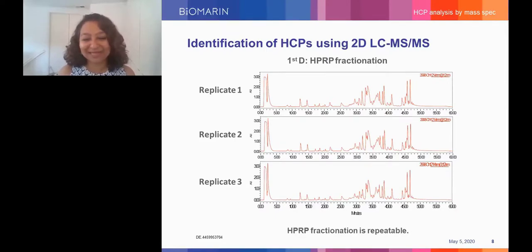And you can see here that all of the peaks are lining up quite well. And so if you are comparing 2 different samples, for example, then you would assume that the suppression from a given coeluting peak is similar in all of your samples. And so the response factor won't be inadvertently suppressed in one sample versus another due to irreproducible gradients.